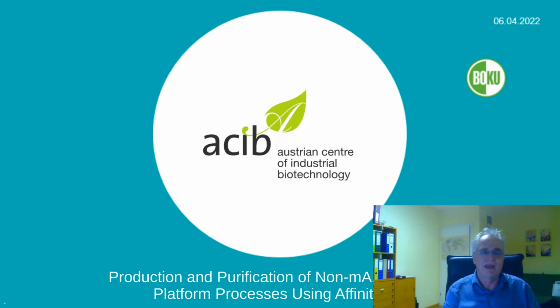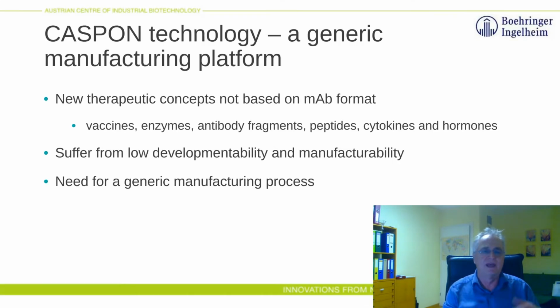We have worked in the past on generic manufacturing platforms, and then we also came across other platforms. I will try to give you an overview of a couple of these platforms, how they can be used for the production of non-mab proteins, discuss the pros and cons, and then give you a couple of examples from our latest developments.